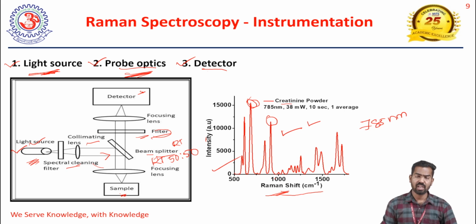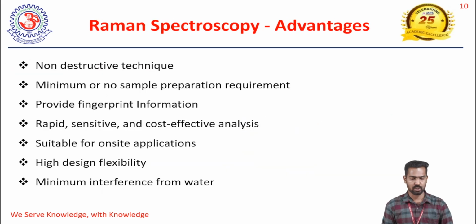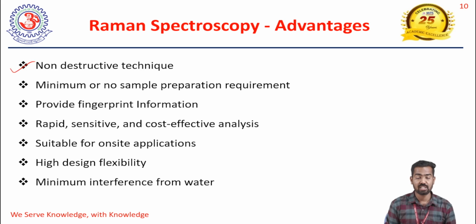Then why are we focusing more on Raman spectroscopy? That is also very, very important. What are the main advantages of Raman spectroscopy? First, you can see this is a non-destructive technique, which I already mentioned in the previous slide.